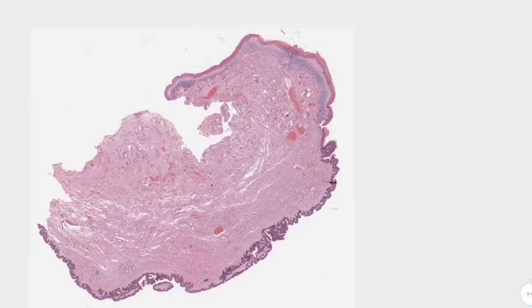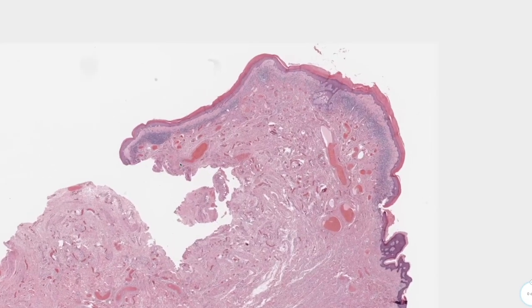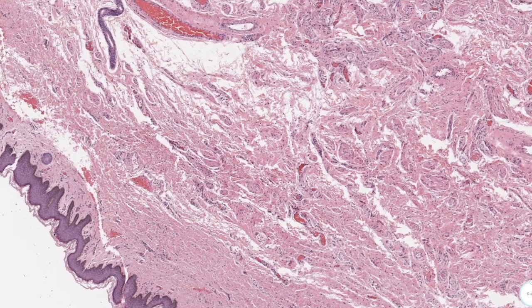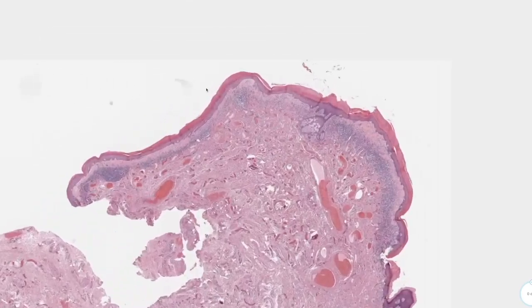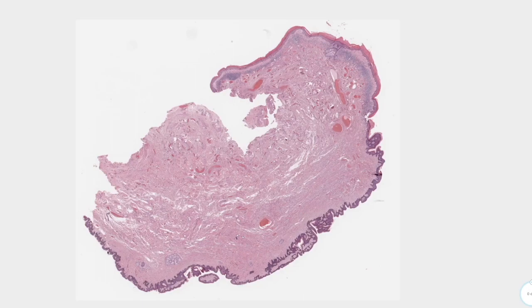Going back to low power, in the affected area, the rete pegs are conspicuously absent, meaning the epidermis here is atrophic. Another finding is that the keratin layer is much thicker in the affected part compared to the normal area — this is hyperkeratosis, a very thick layer of keratin.